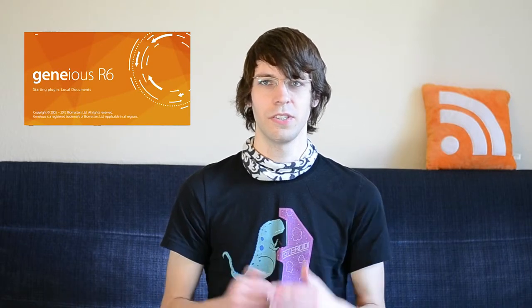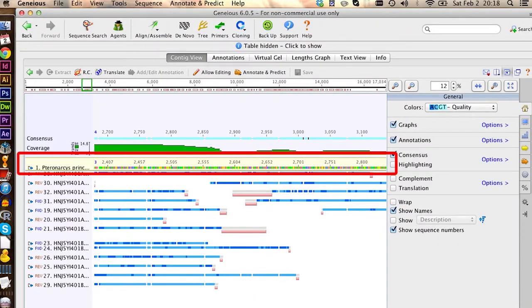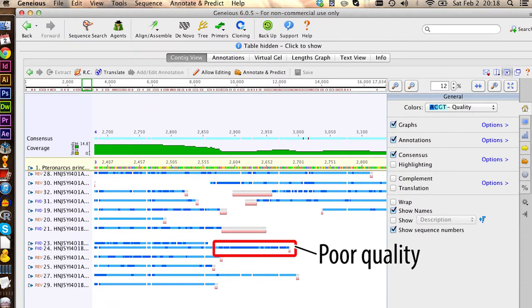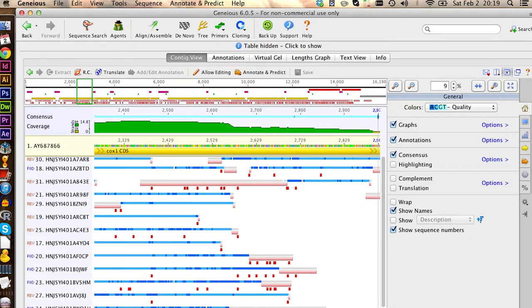Those reads you can put into Geneious to assemble your genome with the help of the reference genome. What you see on top is the reference genome of Pteronarcys, and down below the blue lines are the actual sequences with quality scores. The lighter the blue, the better the sequence quality. As you can see initially, there are some gaps. By sorting out all the errors in the alignment, we can then create the first draft genome of Dinocras cephalotes.